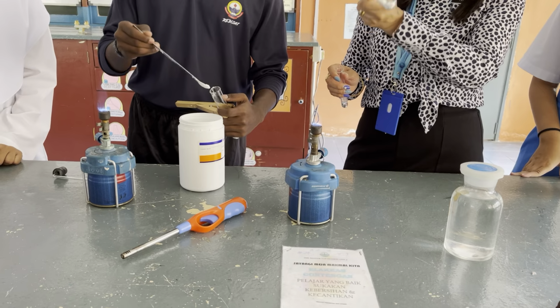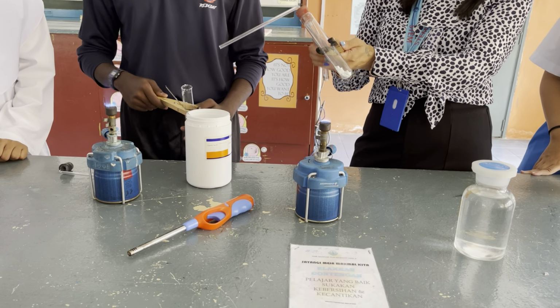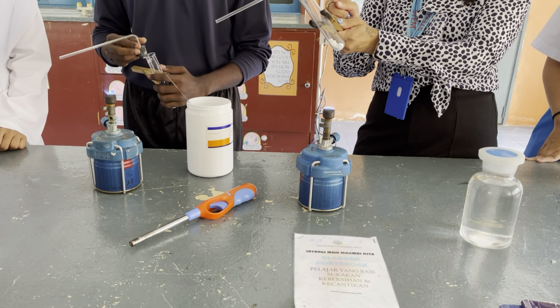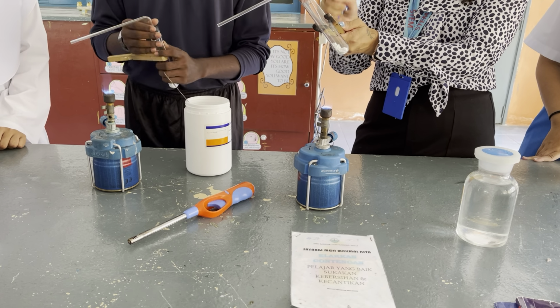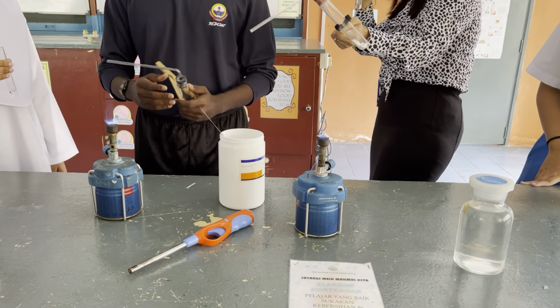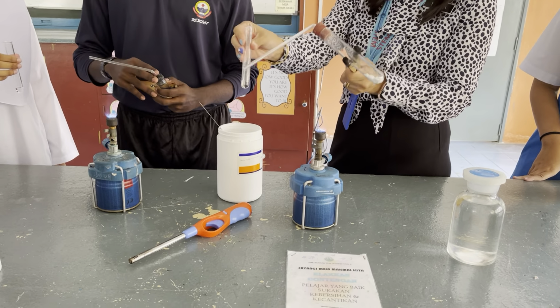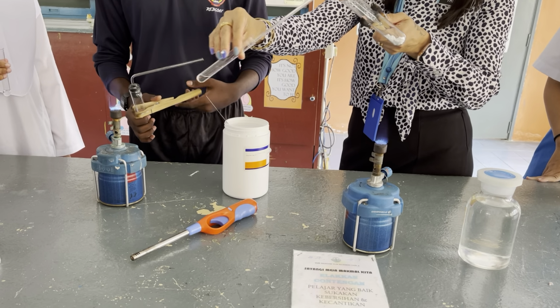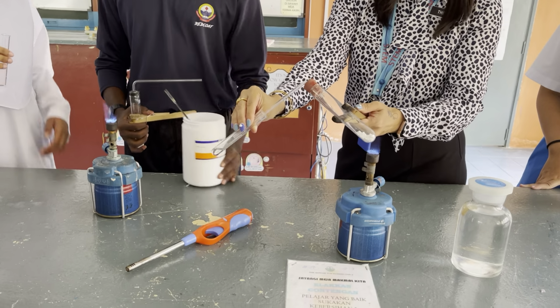Okay, the purpose of this assessment is to find out whether calcite or calcium carbonate consists of different elements to form a compound. Okay, start by heating up first. Let's see what you get in the lime water. This is the lime water.